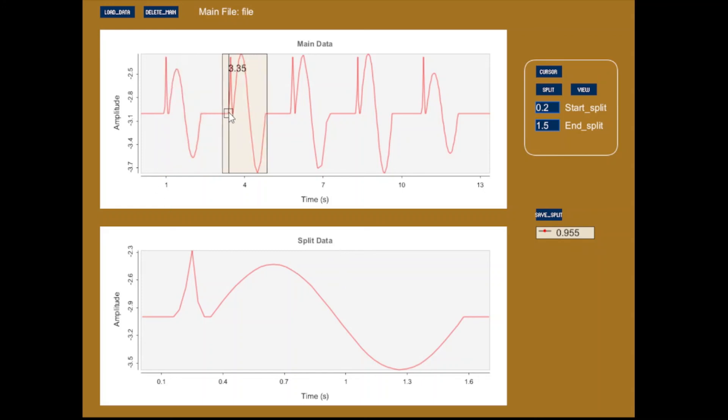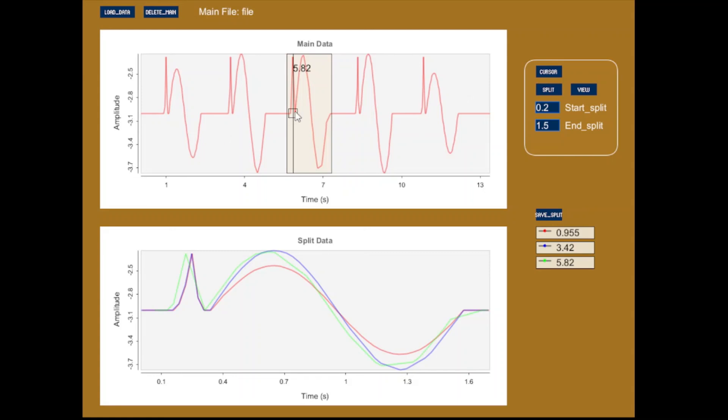Moving over here, we can now pick this next set of electropherogram data. It starts at 3.42 seconds, and when we hit the split button, we now have this blue data at 3.42 seconds. We can get that next one, hit the split button, move the cursor, split again, and I will collect our fifth and final data set there. So this gives us all of our data in an overlapping viewable mode, and hopefully that will be useful to you.